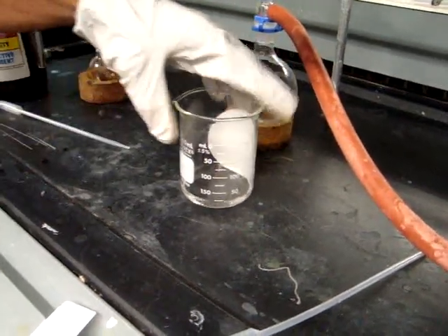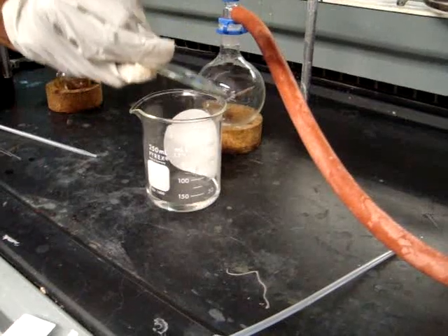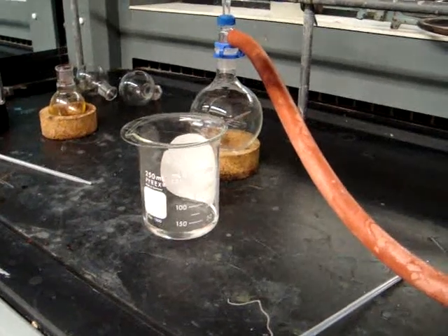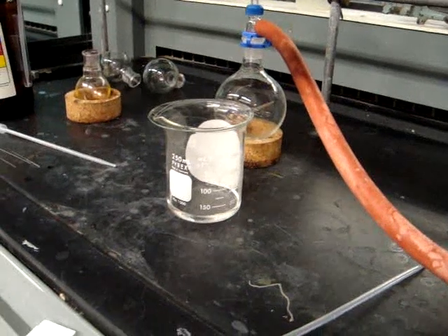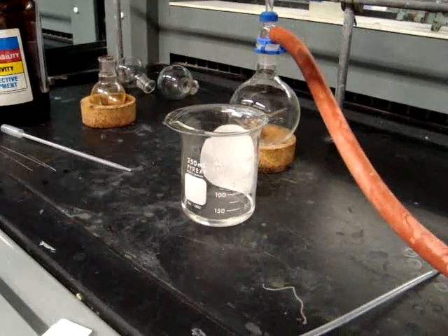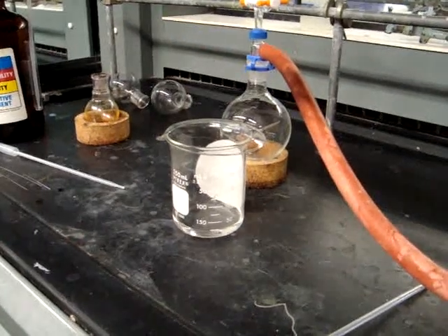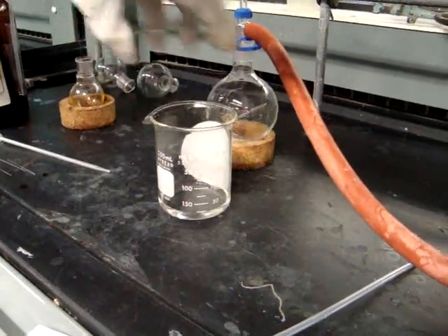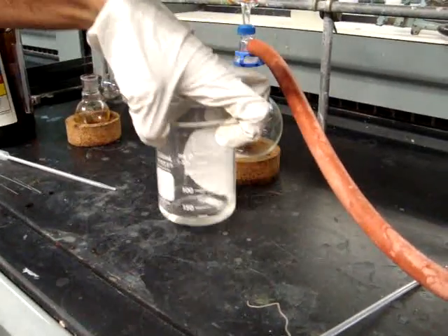This is the TLC chamber, which contains the beaker, the watch glass, the filter paper, and the solvent system. We have arbitrarily chosen the solvent system to be 85% PET ether and 15% dichloromethane. You will be making 10 milliliters of your chosen solvent system, which will be assigned by your TA. For us, we added 8.5 milliliters of PET ether and 1.5 milliliters of dichloromethane, and then added about 8 milliliters of that into the beaker.